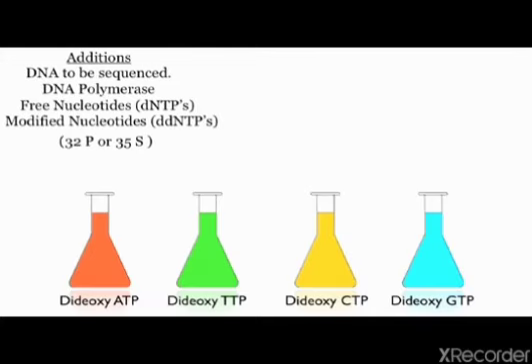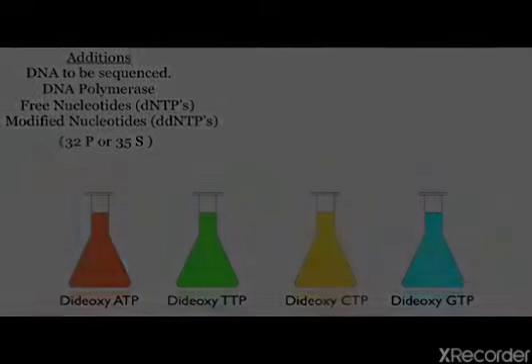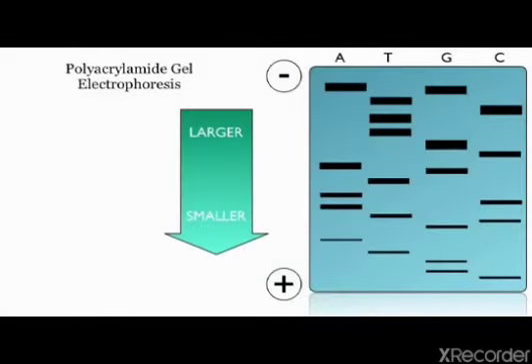For example, a DNA strand taken from the flask to which dideoxy-ATP was added will end in an A, or adenine nucleotide. We can use this information to determine the sequence of DNA by reading across the various bands on the X-ray film.